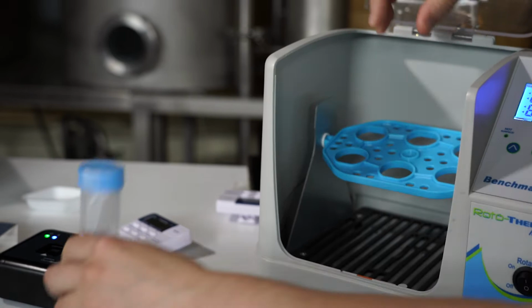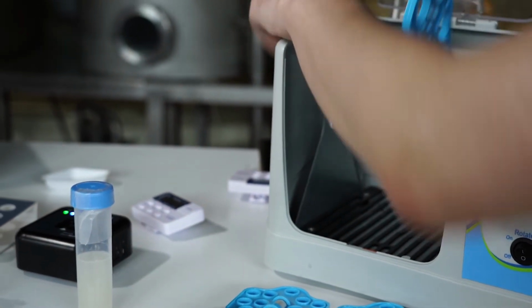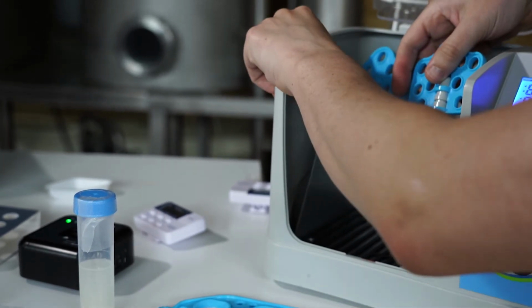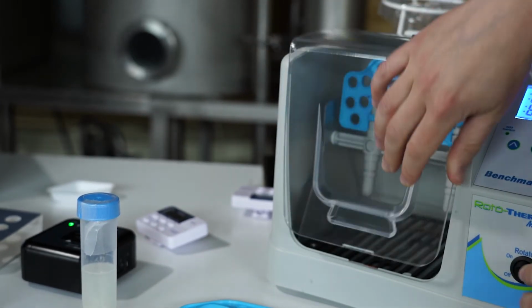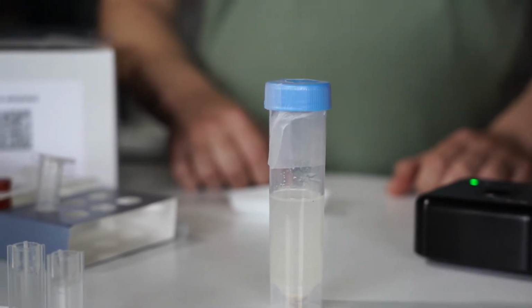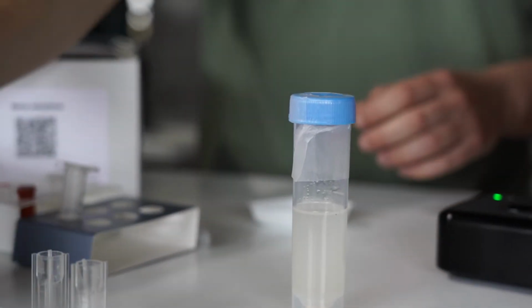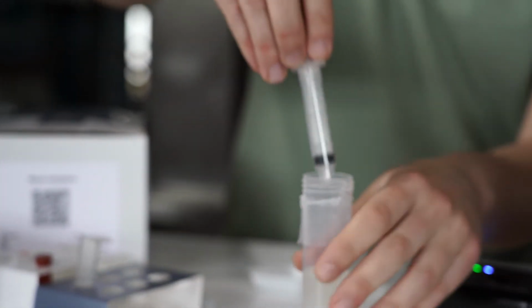We can also take the opportunity to take the whole holder out of the heating box, and then we place the new holder, the holder for the Eppendorf tubes. What we have here is an extraction of the malt, so the enzymes are now in the liquid, but what we need to do is to separate the liquid part from the particulate that it could have.